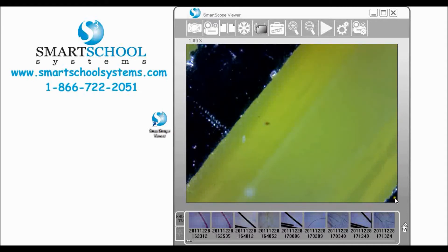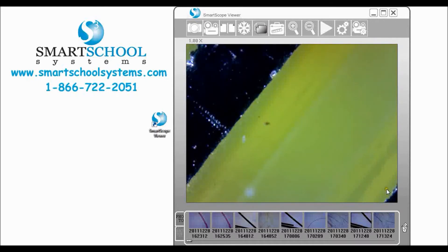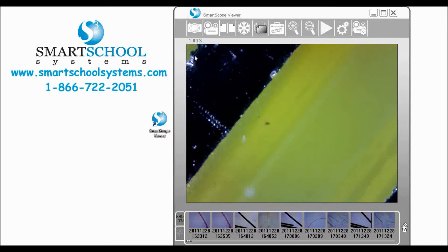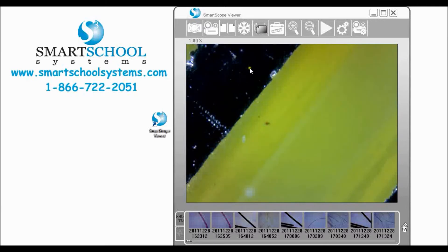With the SmartScope 500 I have to put our ruler up at an angle so that I can fit these two markers within the same window. So this is just at an angle, this marker is going in this direction and this marker is going in this direction.